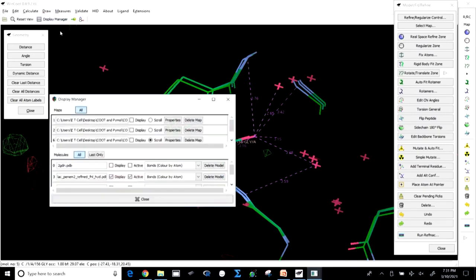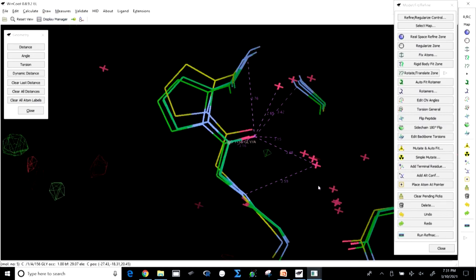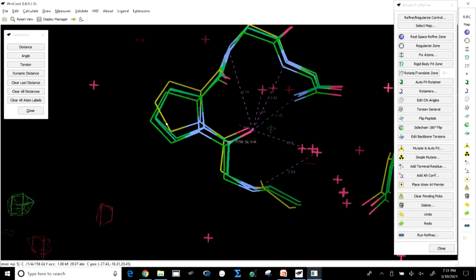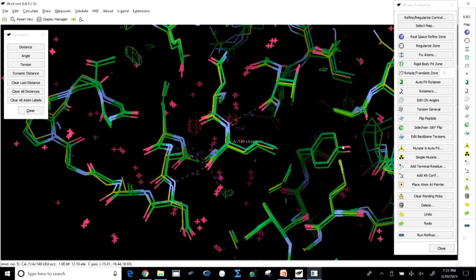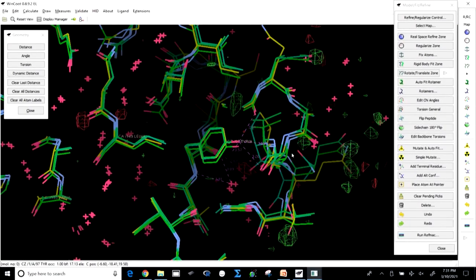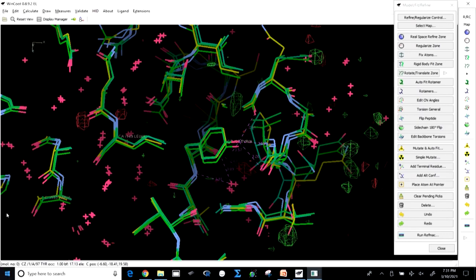All those are complex. When you get 2-GDN, you see that the complex one is in one place and the apoenzyme's amino acid is in another place. So, these are giving you the introspective to understand in-depth knowledge about the chemistry behind the enzymatic mechanism. So, in short, we have seen there are lots of options.